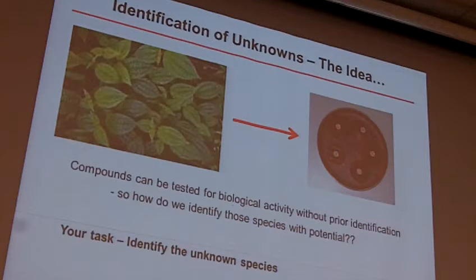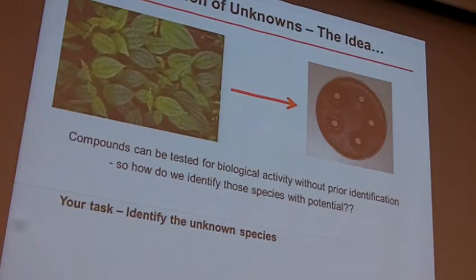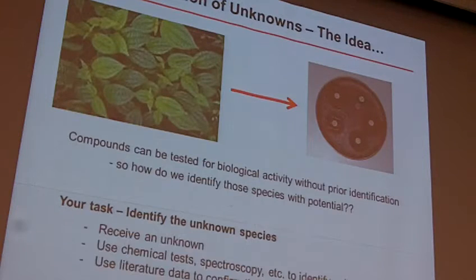So your task is to identify the unknown species. Luckily, we aren't going to send you, or maybe unluckily, we're not going to send you to some tropical forest to harvest things. You get a vial full of one single unknown that you have to identify. How are you going to do that?